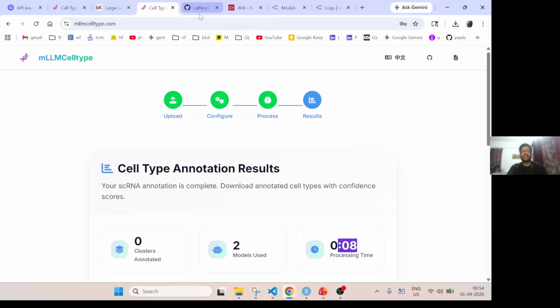But ultimately, the main thing is, it's very easy to do when we are doing an experiment, but when we actually do it, it may consume many tokens, and we need to put in more checks. Instead of relying on such tools, you yourself can build agentic tools, so that you can control how much input and output you want. You can restrict the tokens, put in some guardrails, play with the system prompt, lots of things you can do. But if you're very new to programming agentic systems, then these tools are definitely a game changer.